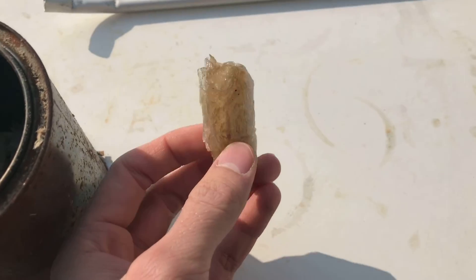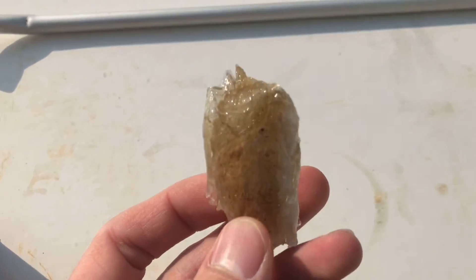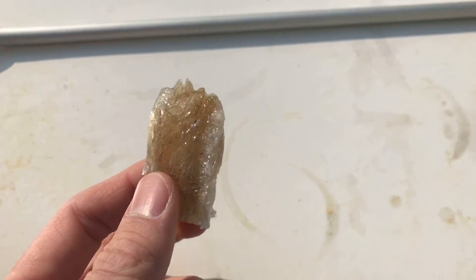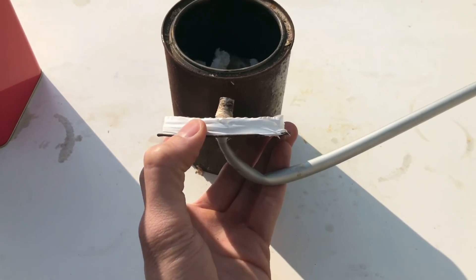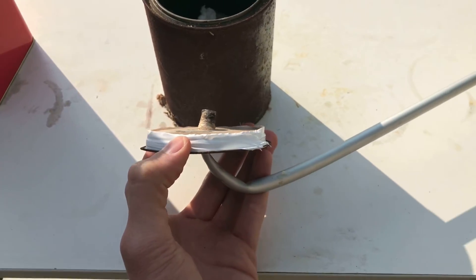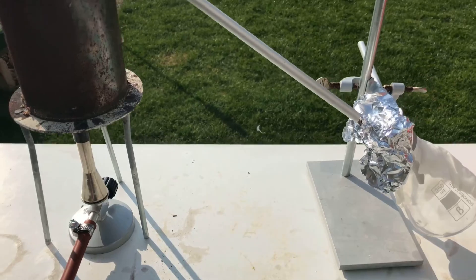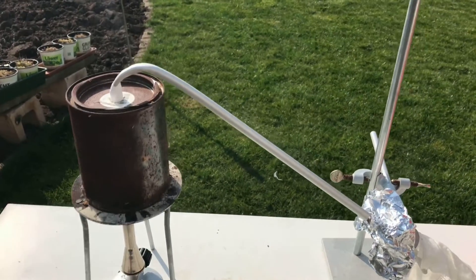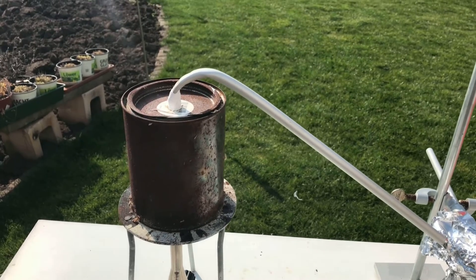It's possible to use styrofoam directly, yet this is inconvenient. If you use the process I just described, you can reduce the volume by a lot. To ensure a good seal, the lid was wrapped in some PTFE tape and we were ready to go. Have a look at the entire setup. There we have this Bunsen burner below the paint can with the styrene, and at the top we have the aluminium pipe as a condenser.